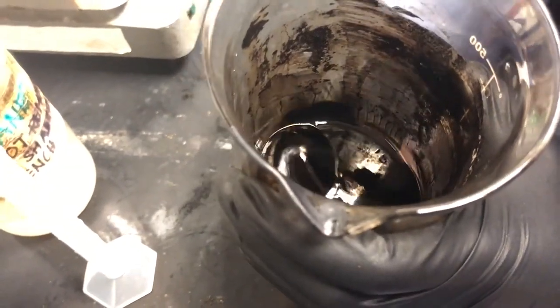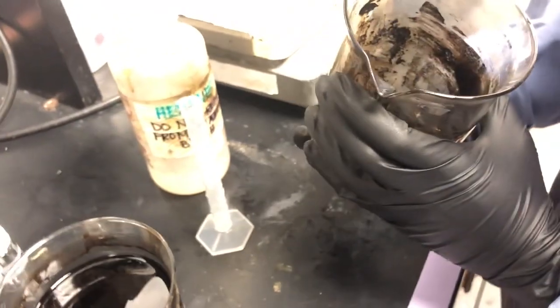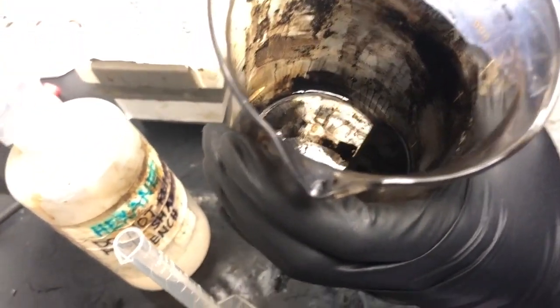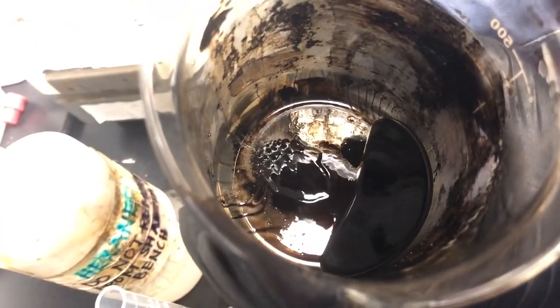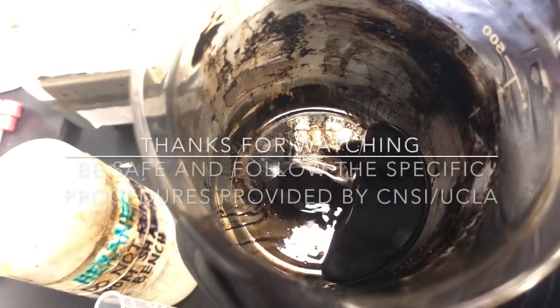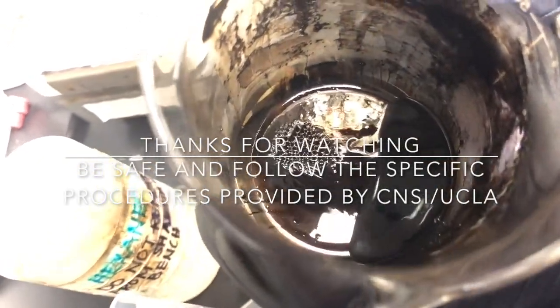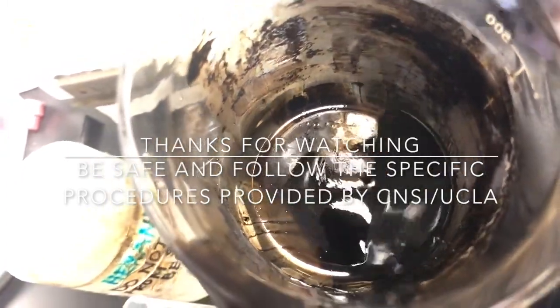All right, so hopefully you're able to use this video and get a better understanding of how to make ferrofluids, especially the balance between the washing. Too much hexane, not enough hexane, too few washes, not washed well enough. It really is a balance, but you can see here what the end results are, and hopefully you are able to achieve this. All right, good luck.